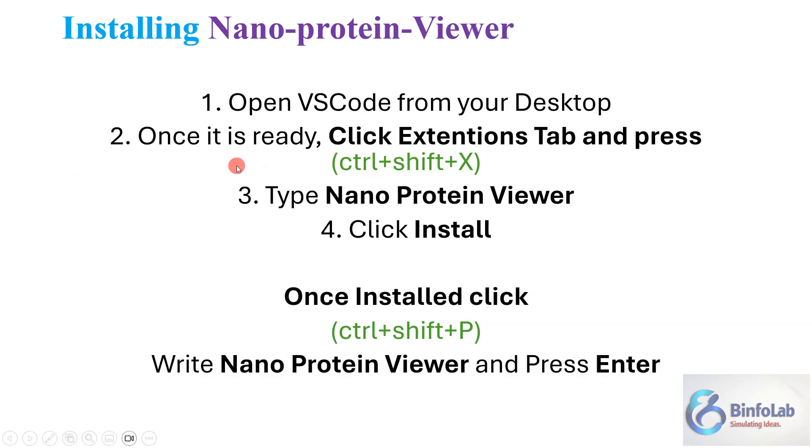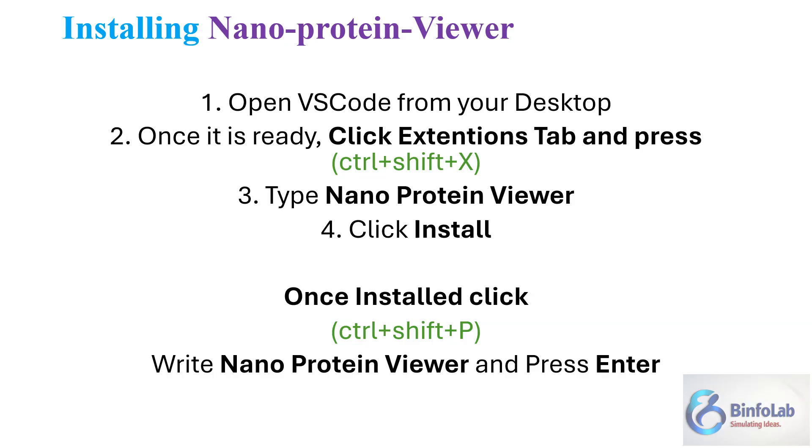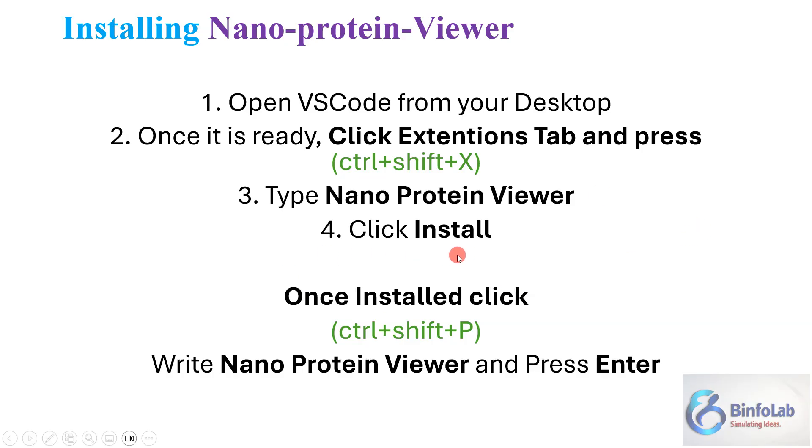The first thing is to download it and then install it in your computer. It will install the Visual Studio Code, not the nano protein viewer yet. Now open the Visual Studio Code from your desktop. Once it is ready and you've set your themes, click the extension tab and press Control+Shift+X.